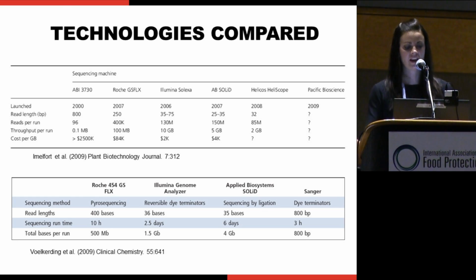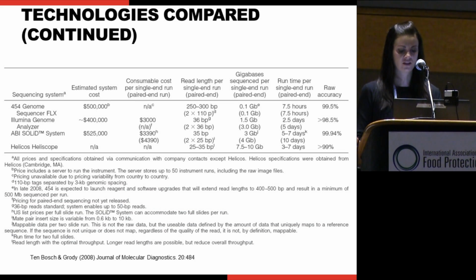And at Texas Tech, in our core facility, we have the MiSeq, and I think that's something that's pretty common. The instrument, you can purchase with the software and everything altogether, the whole package, for less than $100,000. So it's something that you could actually have in an individual research lab.